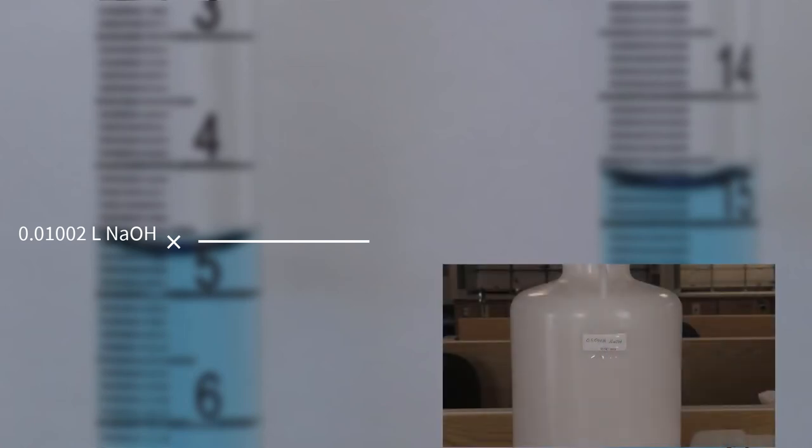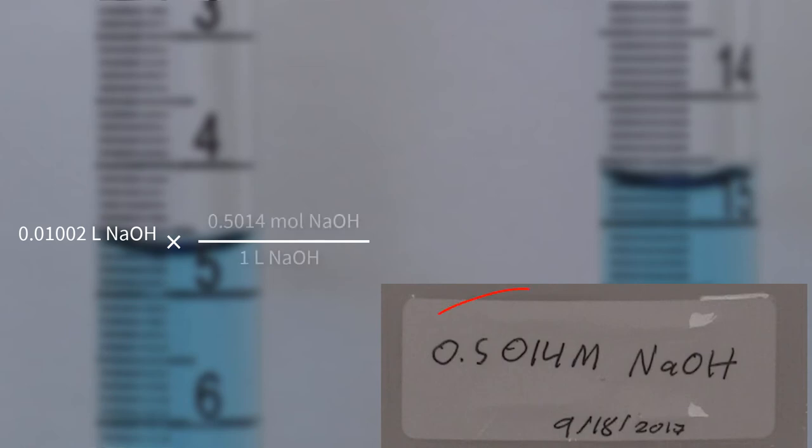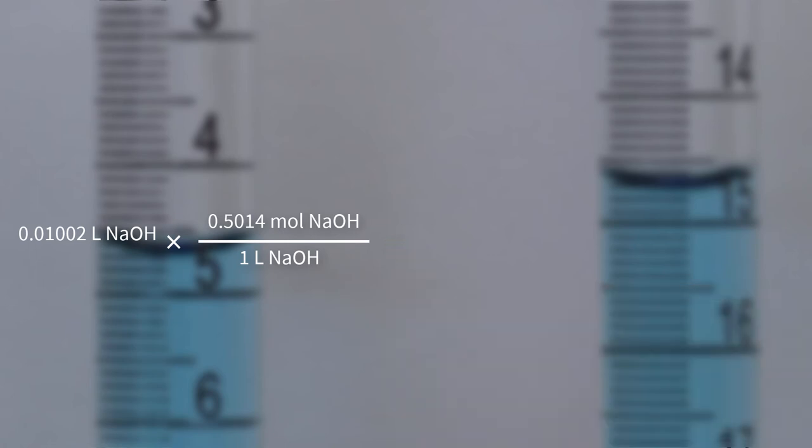The next goal is to determine how many moles of sodium hydroxide Lloyd added to the flask. We can figure this out by multiplying the volume of the sodium hydroxide in liters by the molarity of the sodium hydroxide. Where do you find the molarity of the sodium hydroxide? It is on the container where you obtain the solution. Make sure that you record this in your lab notebook. In this case, the molarity of the sodium hydroxide is 0.5014. But for your experiment, it may be something different. Let's include this molarity in our calculation. Liters are on the bottom so that we can cancel out the liters of sodium hydroxide added.